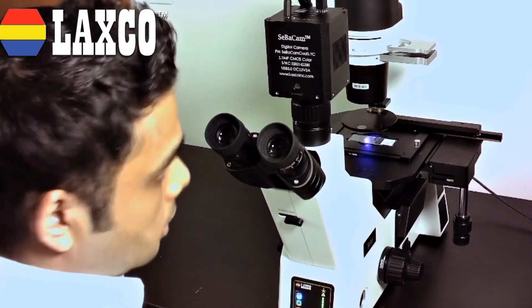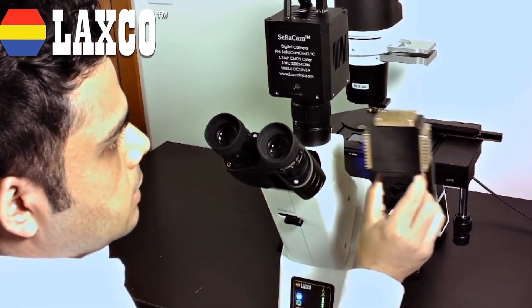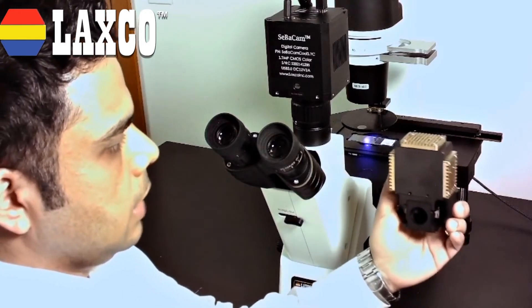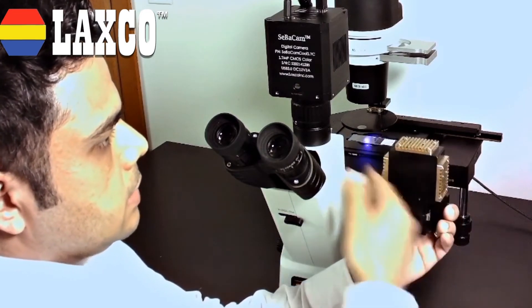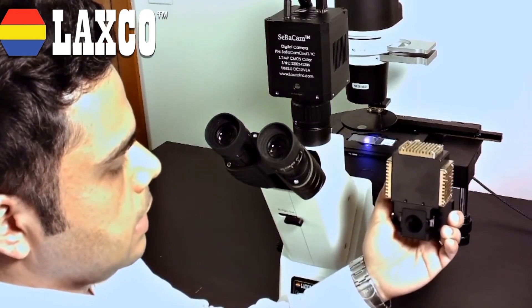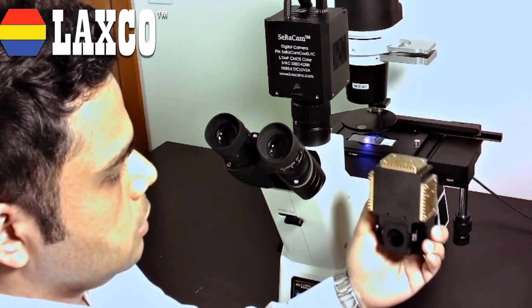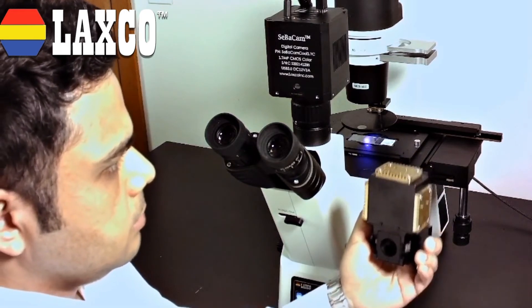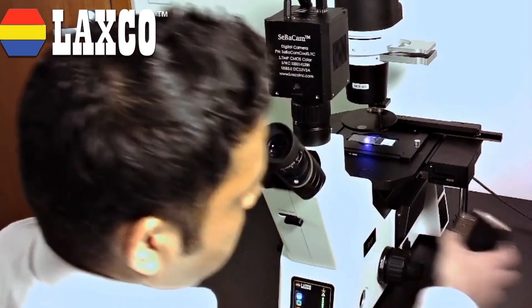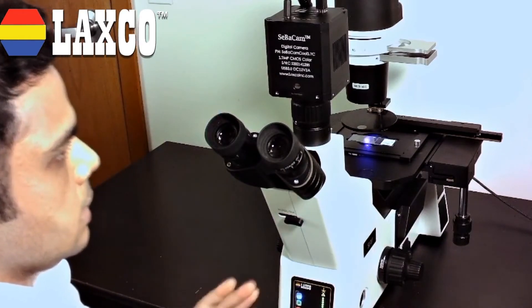Now let's look at the secret sauce that's driving this system. This is the fluorescent module that is driving this system — our patent-pending fluorescent light cube. The three LEDs are situated on the side, and this is driven by one fluorescent cube that is used both for excitation and emission. This instrument is also field upgradable. So if you choose to get a fluorescence upgrade later, it can easily slide in to the side. This side panel just comes off and you slide it in, and your system is ready to go — a fully functional multi-channel fluorescent system.